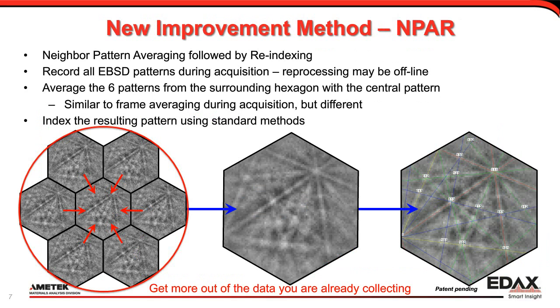The routine I'm going to be talking about today we call NPAR — neighbor pattern averaging followed by re-indexing. What we do is record all the EBSD patterns during acquisition. NPAR can be done during acquisition but usually it's done by reprocessing the data sets offline. The logic is that you average the six neighboring patterns with the central pattern, giving an average of all seven patterns around that central pattern. When you average those patterns, the noise gets averaged out, and the signal-to-noise increases so that the pattern quality gets better. The advantage is you only have to do a single exposure.